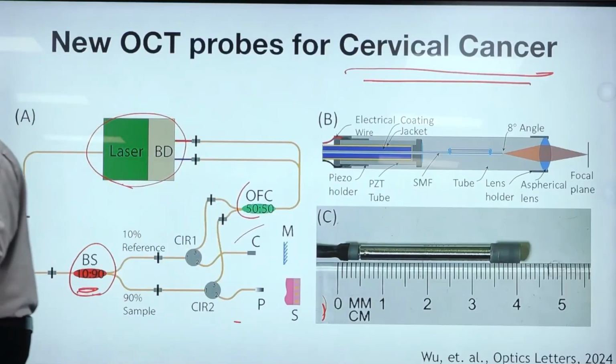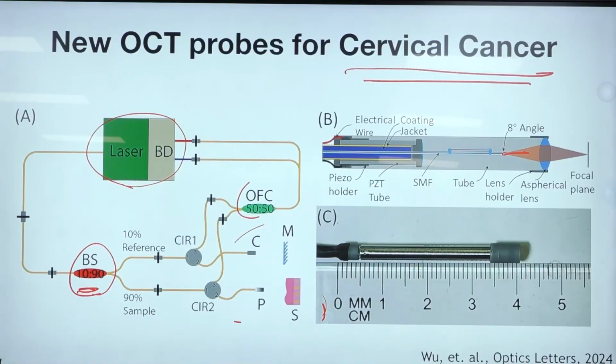And we have a lens in front. Light comes out of here, and the lens in front focuses it to a point. When you move the fiber, it focuses to this point, this point, this point. So you can create a focused beam at any position you want, and then keep moving the beam, and you can create a scan. That's essentially the idea. Any questions?